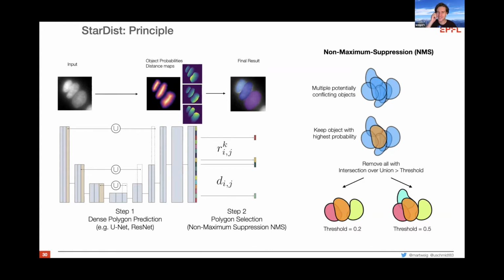It's already hard to annotate these kind of images, but with overlap, that would be, I think, a bit too much. Yeah, so you don't annotate with overlap, typically. Okay, but so you still have to annotate the hard cases if you want to get them segmented well, right? So there's no way around it. Like this. But the nice thing is, even if you annotate, all your annotations will be non-overlapping, because it's not technically implemented otherwise. But still, during prediction, there could be multiple hypotheses that are overlapping, and you can then choose to get those overlapping results if you want them.